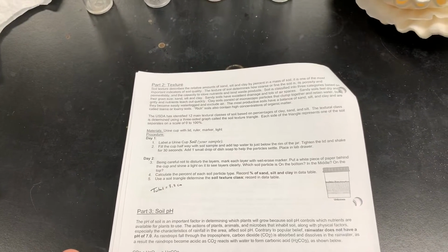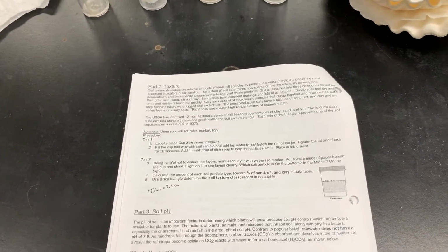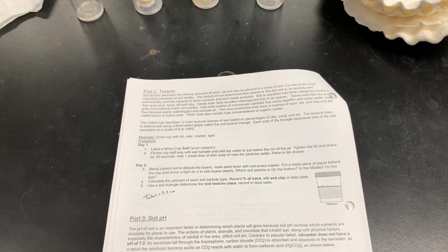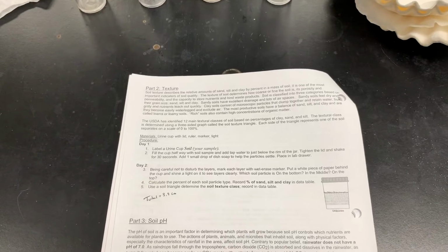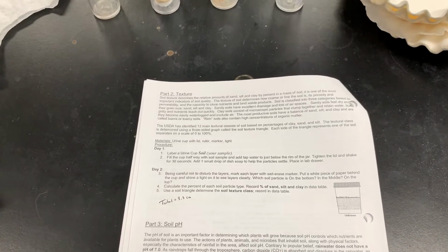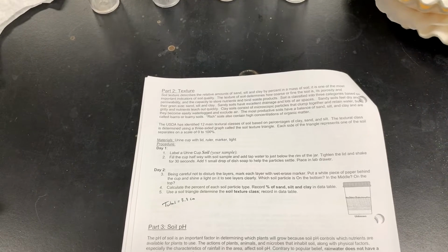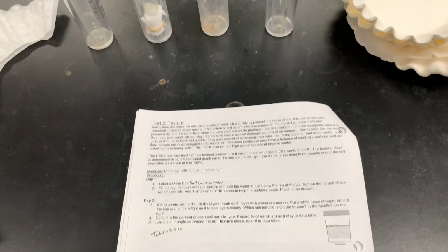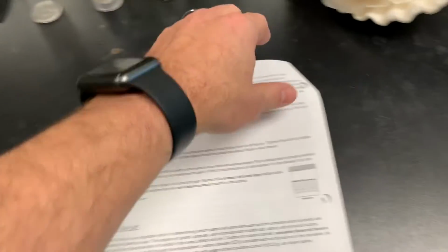And so this is where we're going to actually take a sample from around the school. You're going to take a sample of the soil, and you're going to figure out what percent of sand, silt, and clay you have in your soil sample. This is important because the percents will tell us the type of soil.